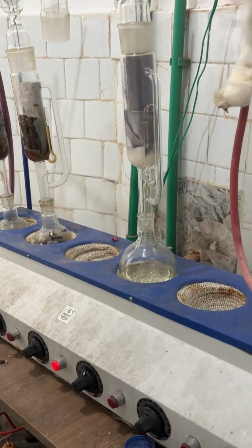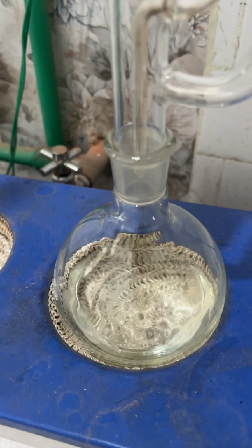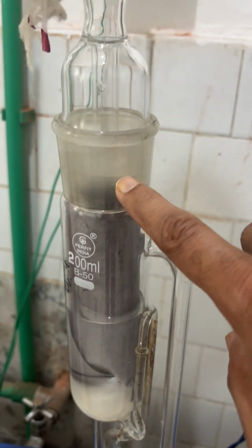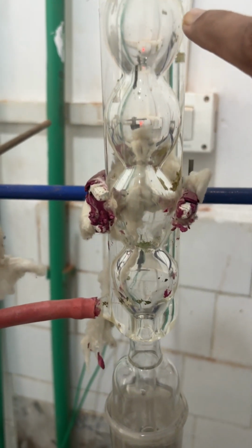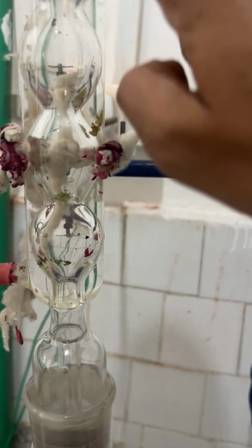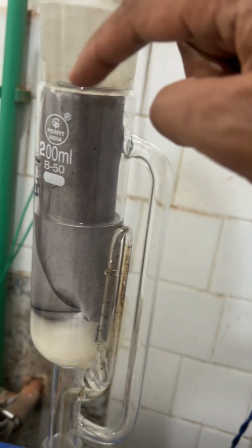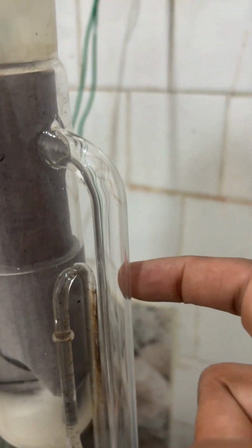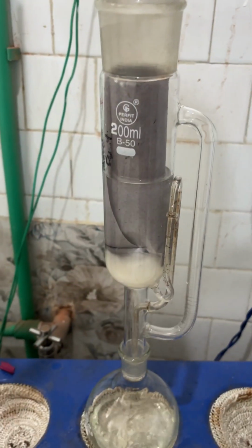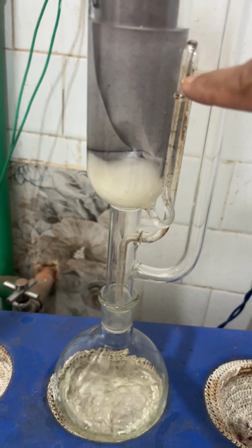So hexane has a boiling point of 68. After a while you see that it's boiling and it will evaporate. Okay, so it will go through this tube up here. It's in gaseous form, so it will go up in the condenser. Okay, and this is the water here, so water outside the condenser will condense it, and it will fall back in this. Okay, so this will fill up, and it will go past this line, and it will again fall in this. So this, we call this reflux, this will keep on going. You can see here, the reflux is taking place.